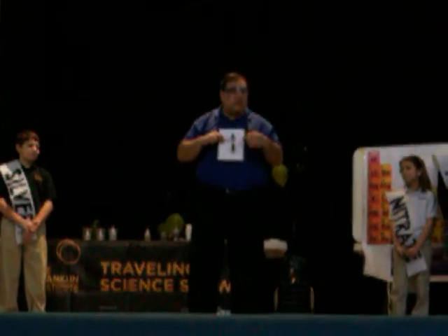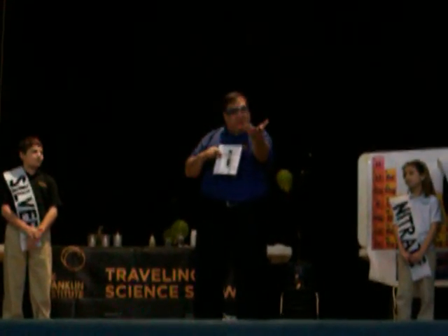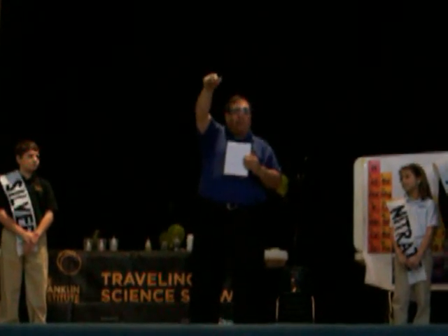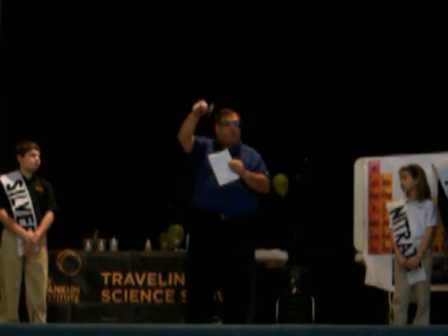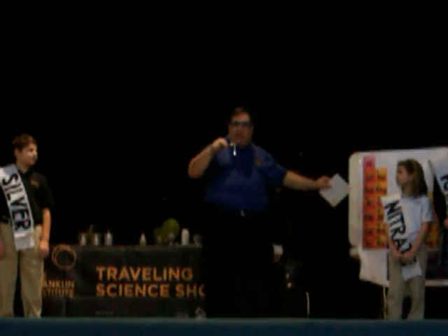If I want to collect this, I can do it kind of like when you make coffee in the morning. I can take a piece of filter paper, I can pour everything in this test tube out. The liquid that will drip through will be a new chemical, potassium nitrate, and it's clear.